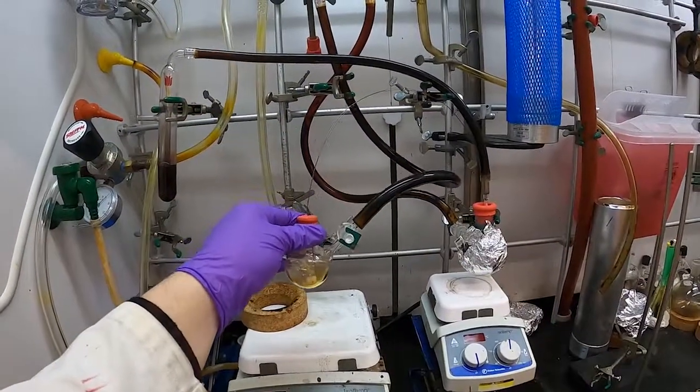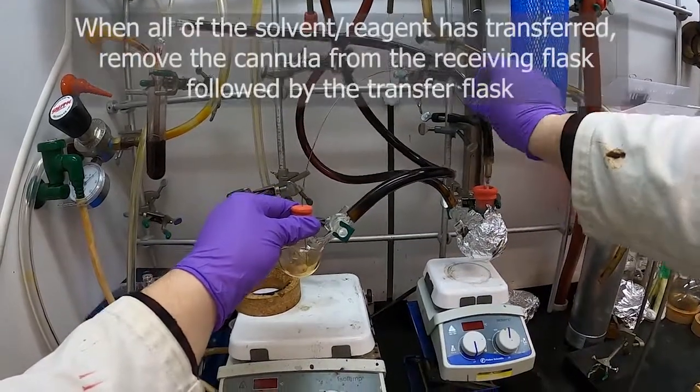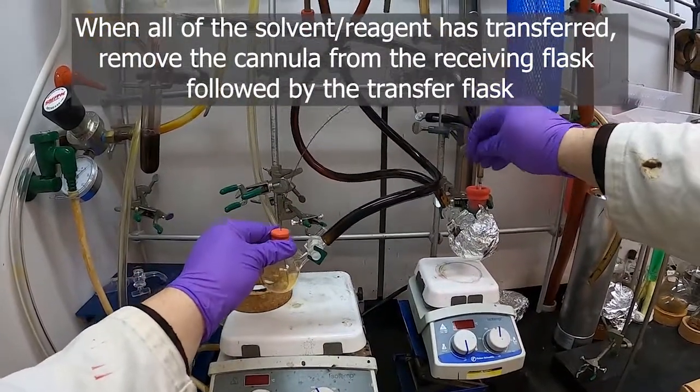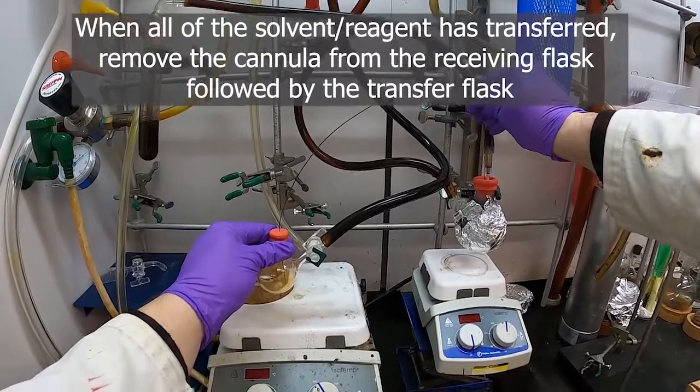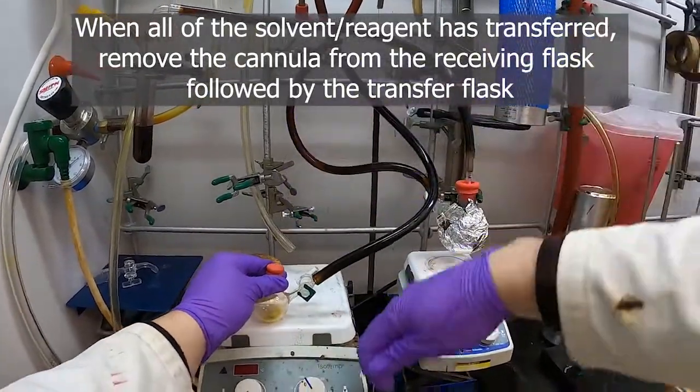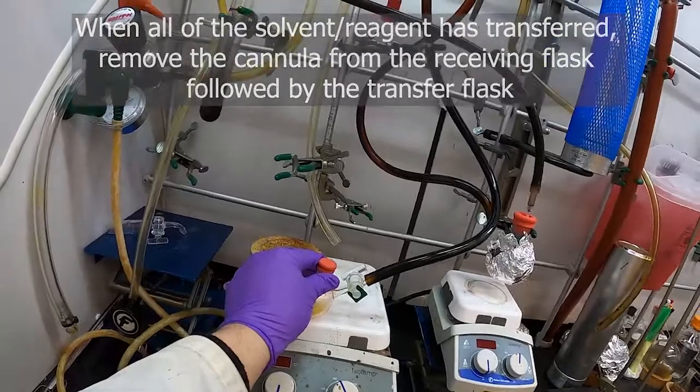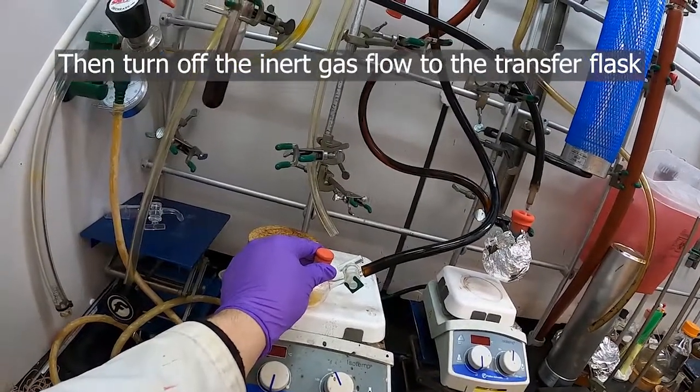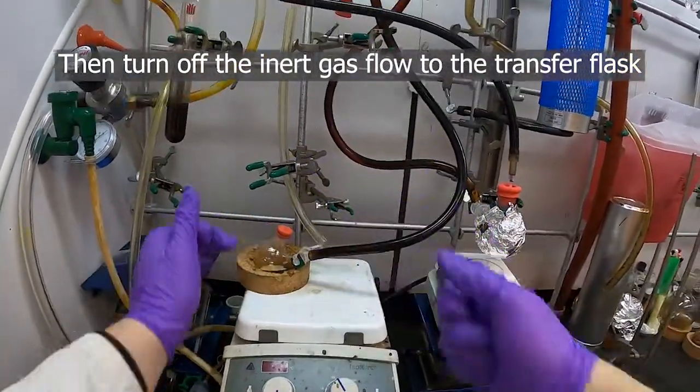All right, so now that all of our solution is transferred over, we'll just reverse the steps. We'll remove this right here and this one from there. Turn off the nitrogen on this now empty flask.